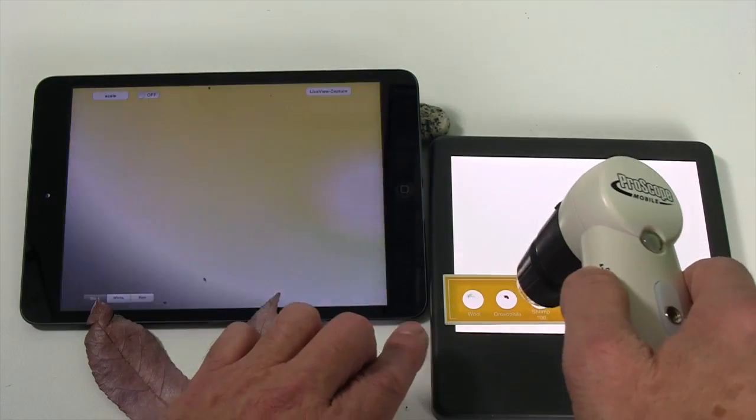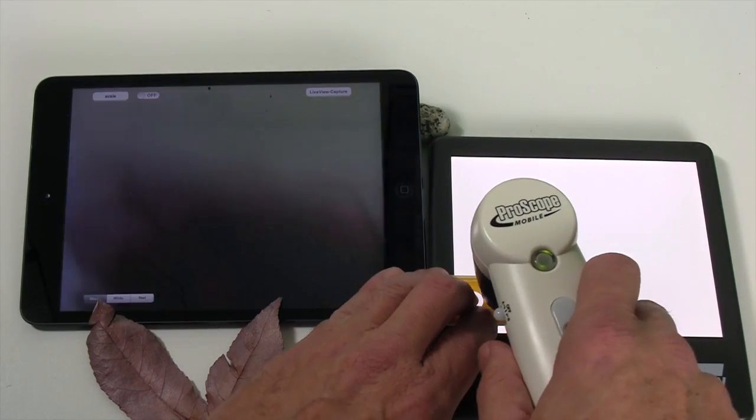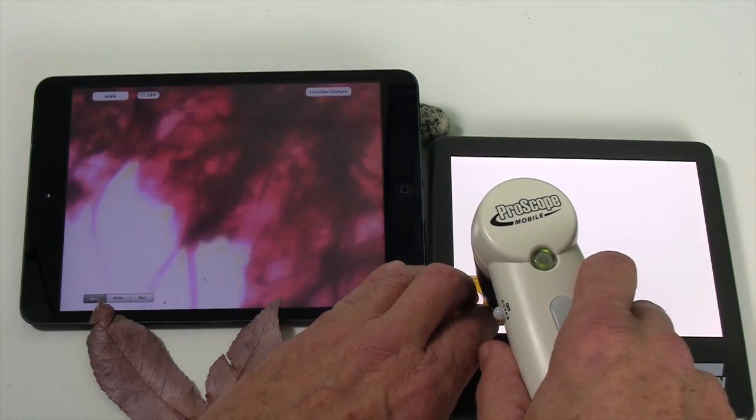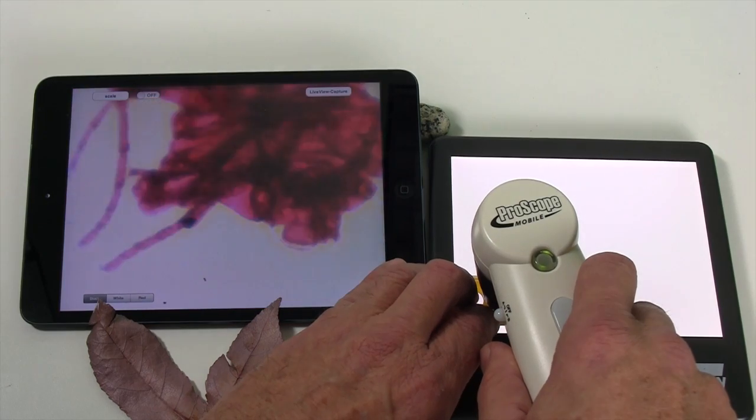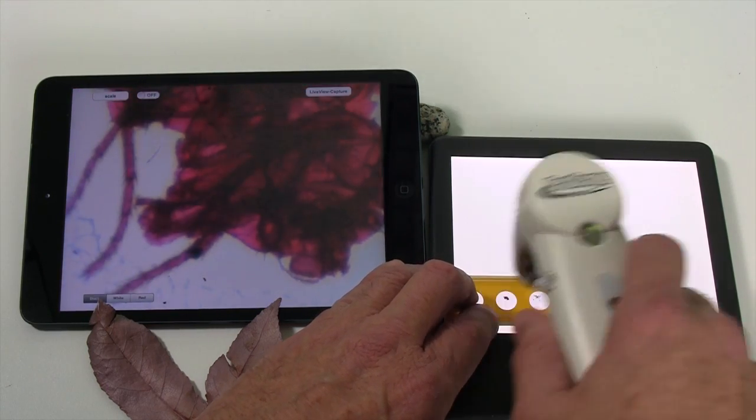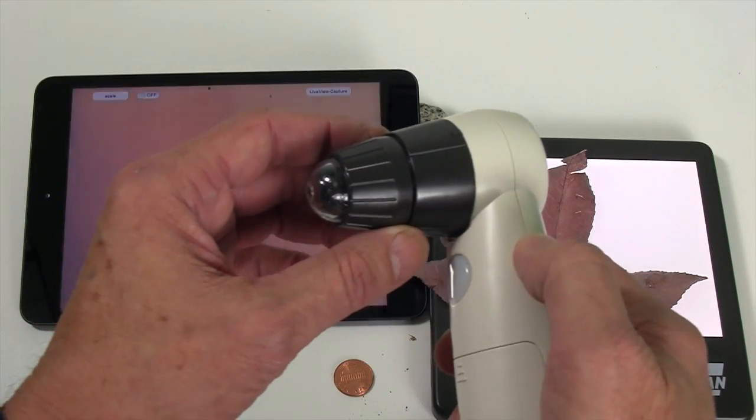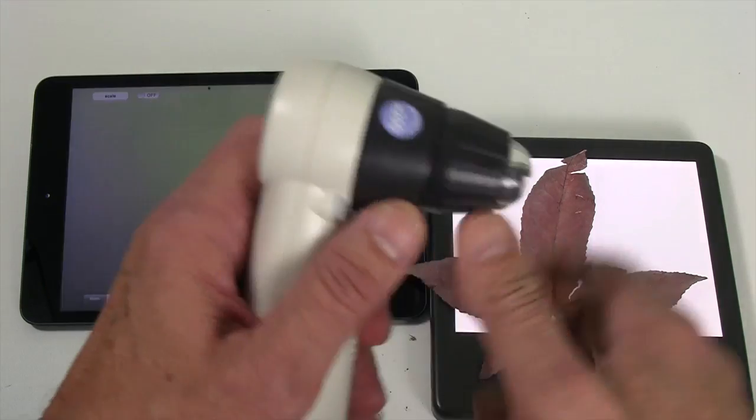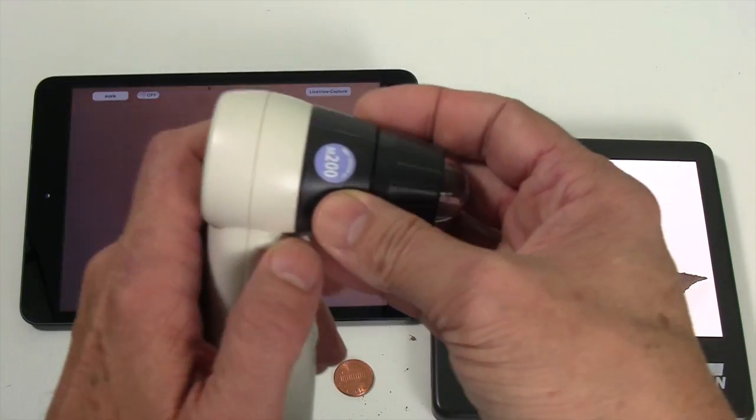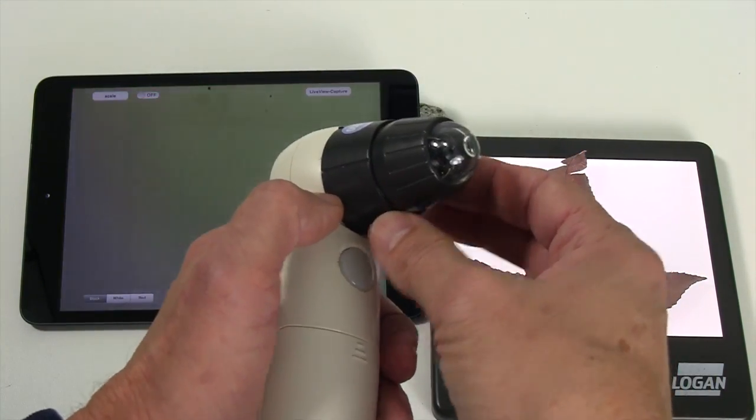Now I'm going to turn this off, and I'm going to use our Logan light pad. And here is the fly at 200 power with that. And this is the 200 power lens. This is what you would want to use to look at plankton or any microorganisms.